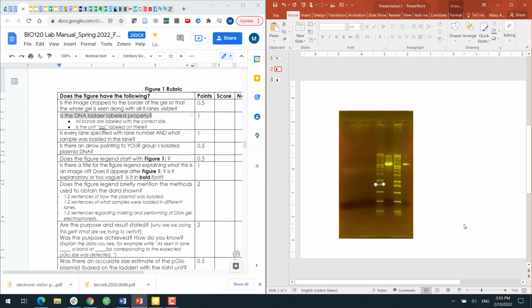As you can see, I'm drawing them together. Now, the next step is you collect all of these bands, and then you move them all the way to one side of the gel. It can be on this side, it can be on the other side. Either way works. I'm moving it to this side because it's closer and it's easier to read this way.